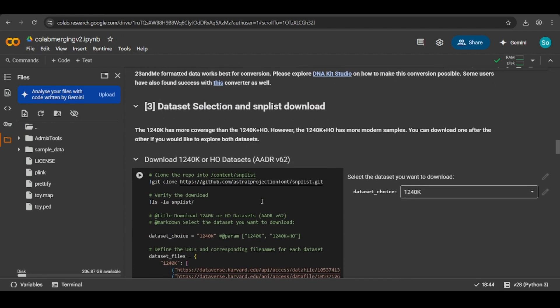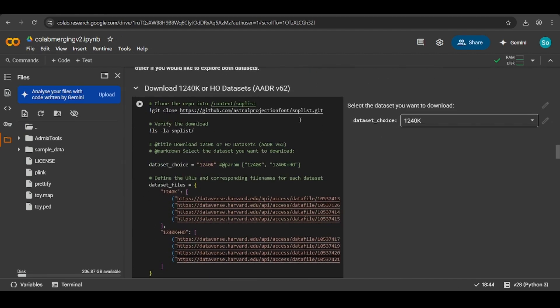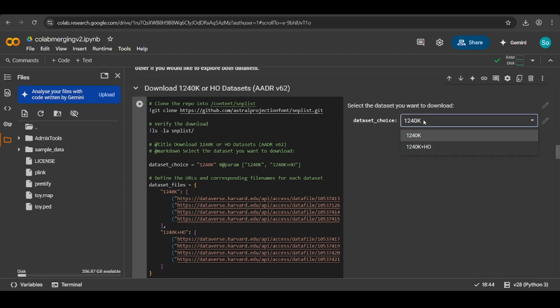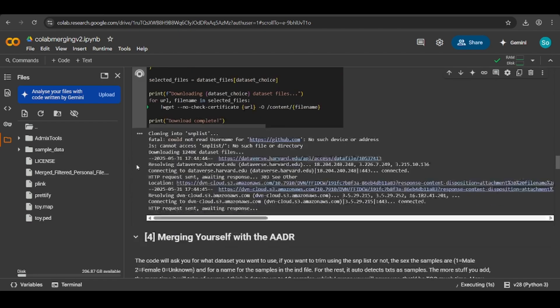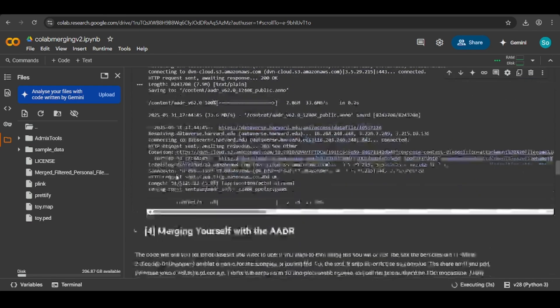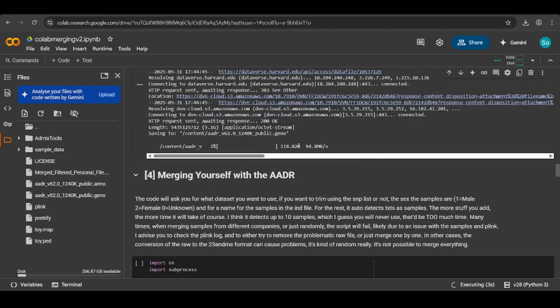Now that's done, you want to download the 1240k dataset. Make sure you don't select the plus HO option. This is because it halves your SNP coverage, and if you're using a personal file, your SNP coverage is already quite low. You don't want to nerf it even further and make it worse. So for this tutorial, you must use the 1240k. Click on it and then click play. This is like a five gigabyte file, so it might take a minute or two to download.